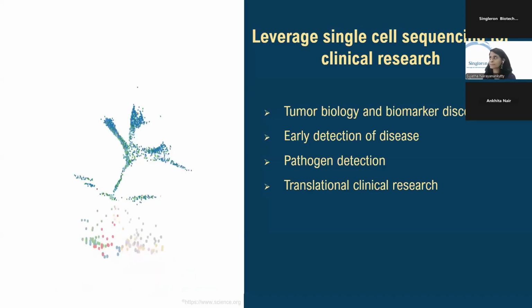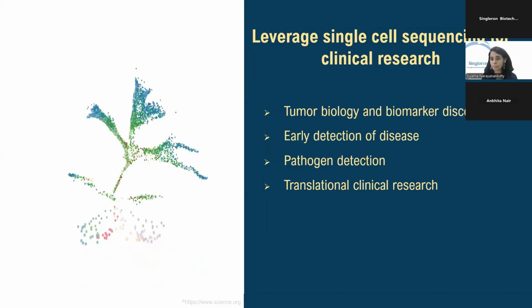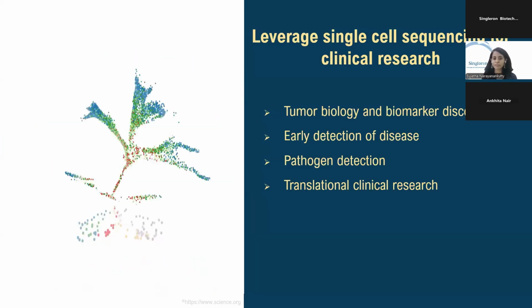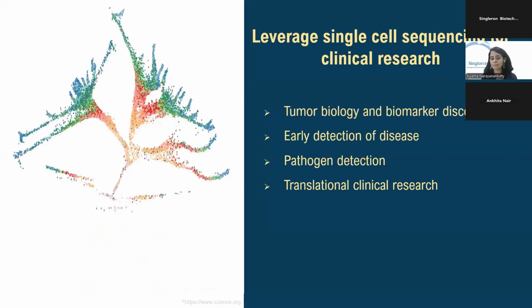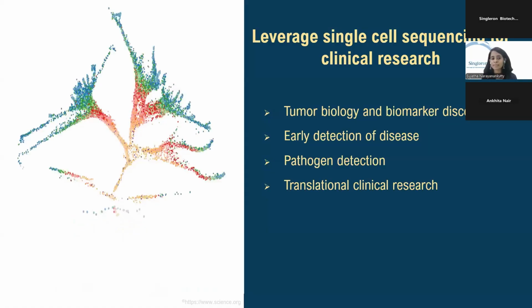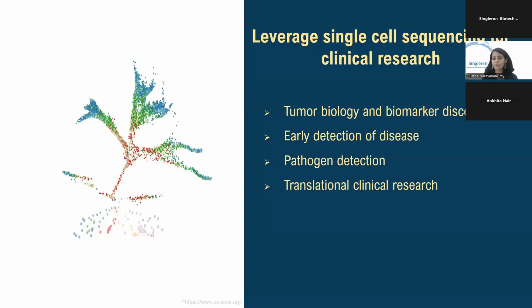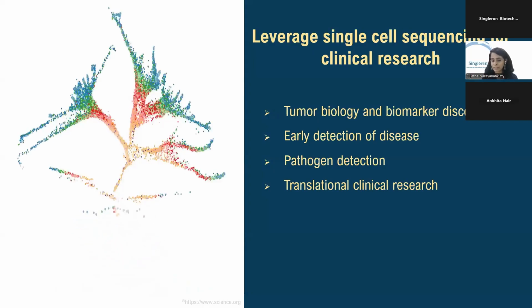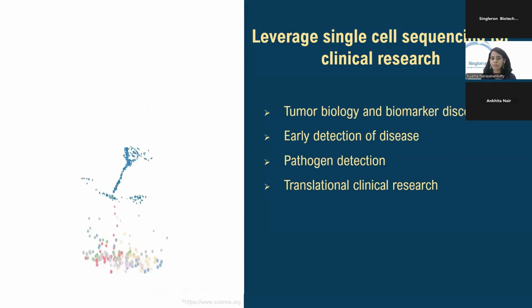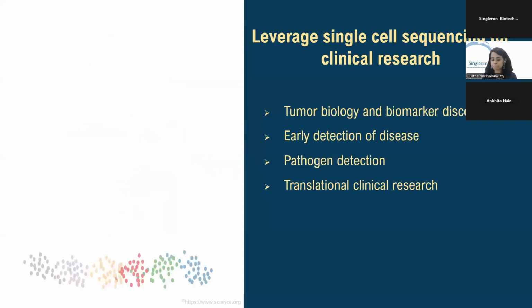Right. So to leverage single cell sequencing in clinical applications, it's a really broad field. For the purposes of today's webinar, we will try to cover it under these sections. One is to see how single cell helps understand tumor biology, and then how that leads to some biomarker discovery, how you can use it for early detection of disease, then pathogen detection, and finally a few examples of how single cells can be used in the translational clinical research space.